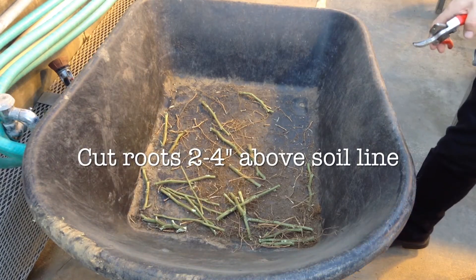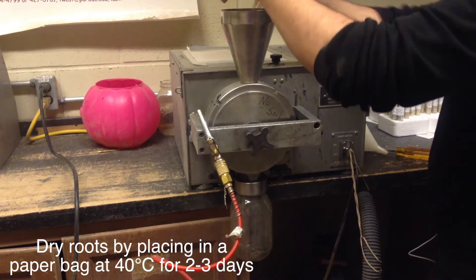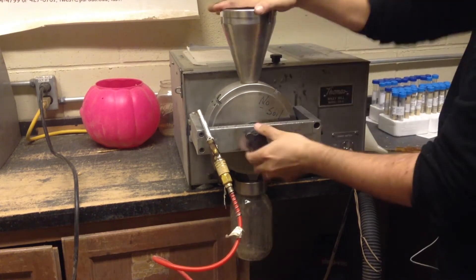We then take sections of these soybean stems and place them in a dryer. The dryer will dry them down and then we grind them up into a powder.